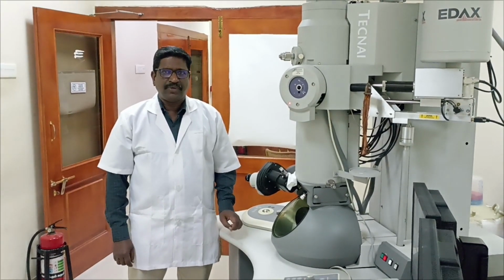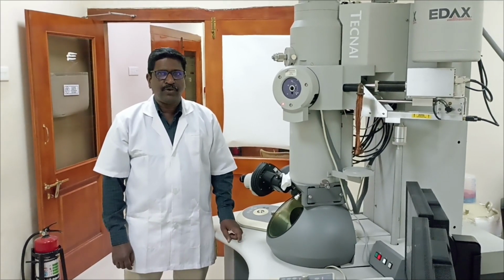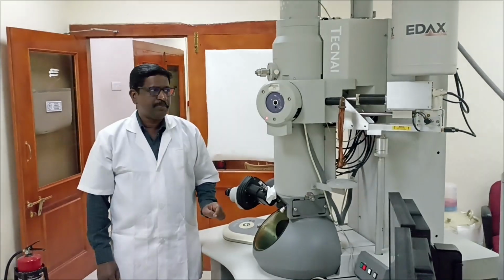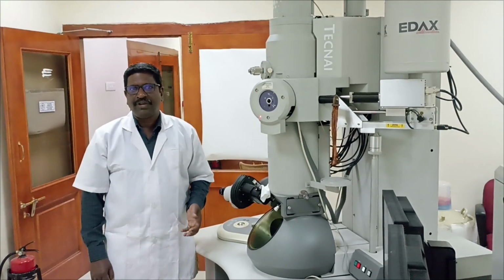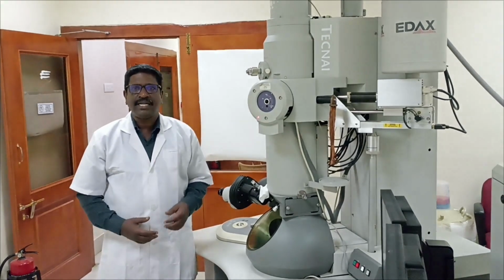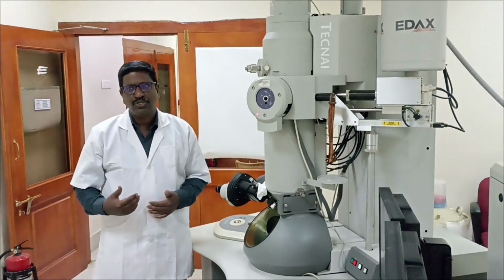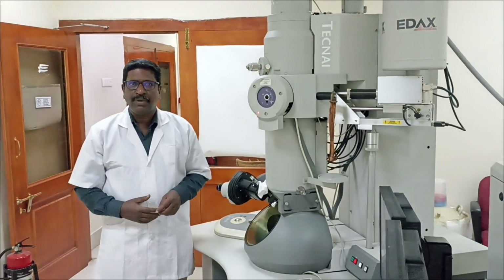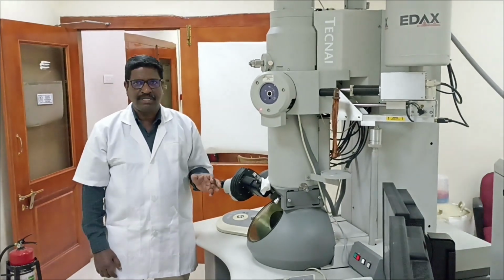So far we have seen the important components of the transmission electron microscope. Now we are going to see briefly the instrumentation of TEM. In case of instrumentation, first we have to prepare the sample. We have to prepare the metal sample and the biological sample. In case of a metal sample, we have to go for sonication, and in case of a biological sample, we have to go for fixation. After that, we have to use the ultramicrotome sectioning machine to get the sample at a very thin size of about 50 to 100 nanometer.